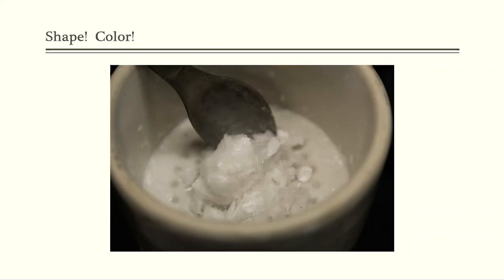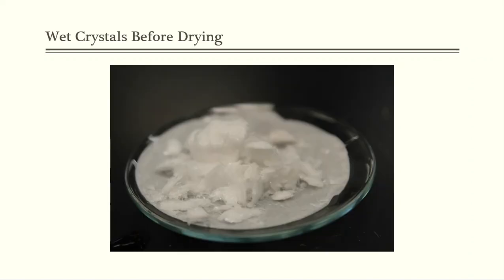And then I took the scoopula inside of the lab, and I scooped it even more up into the center of that filter paper. I think that you can really see the texture of those crystals now. And once more, Walter White would be very proud of my recrystallization technique at this point.